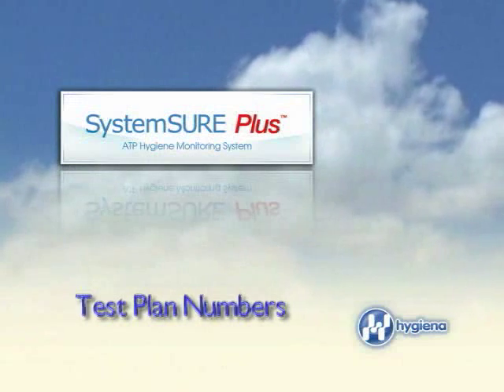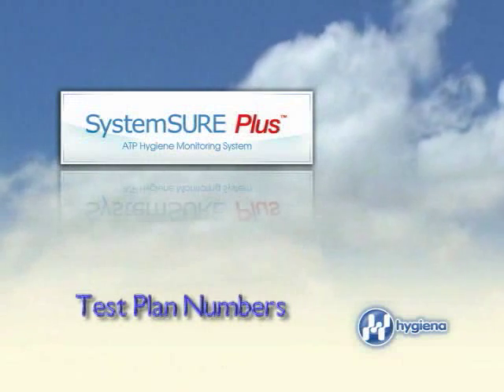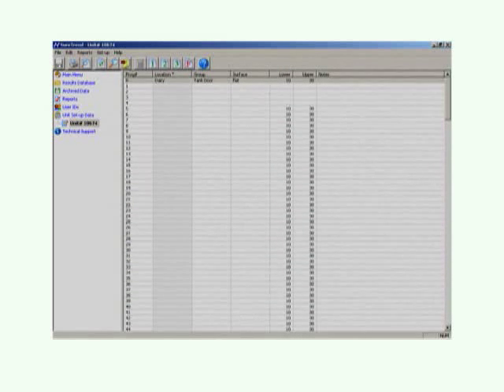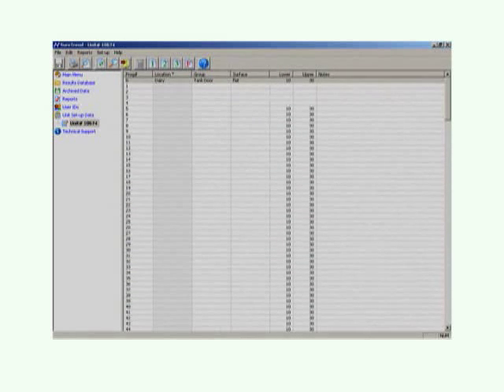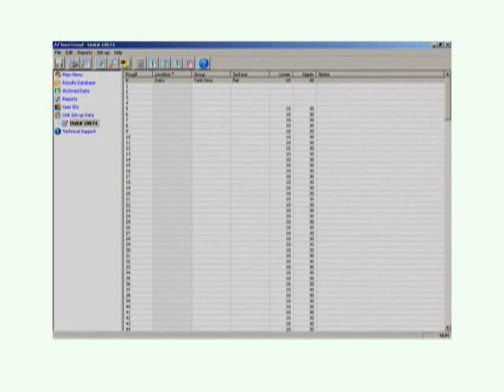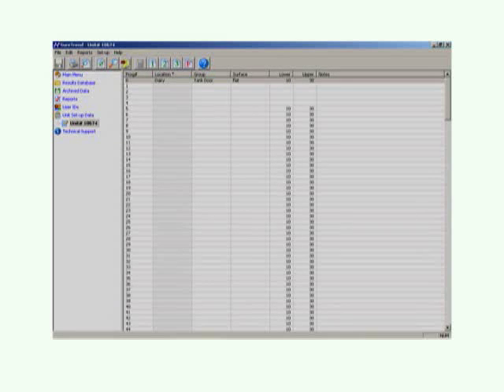After setting up your program number, you can assign a test plan to your location. A test plan is a particular location within your facility where testing should occur. Test plans keep multiple testing locations in order and easily accessible to the user.